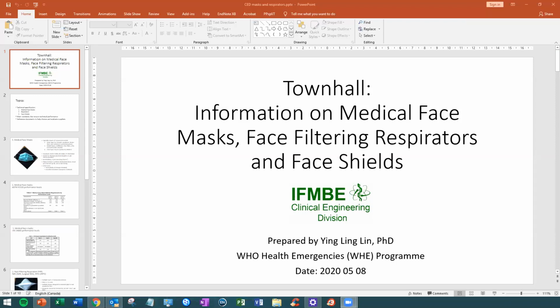I've worked with Adriana for several years, and we're glad that the issue of PPE and the technical aspects of PPE are coming to light, and they are important issues. So just to get right into it, this will be a very brief overview of the technical aspects of some critical PPE items. Can everyone confirm that they can see my screen?